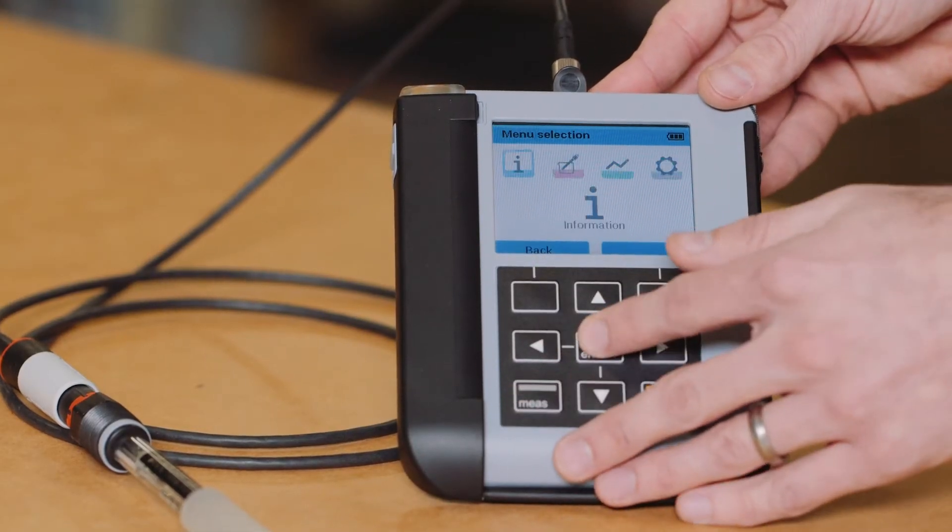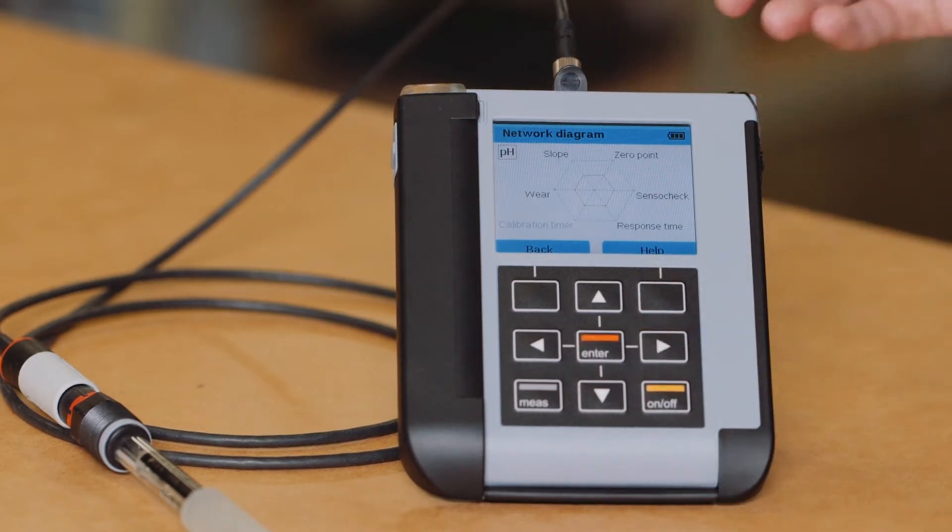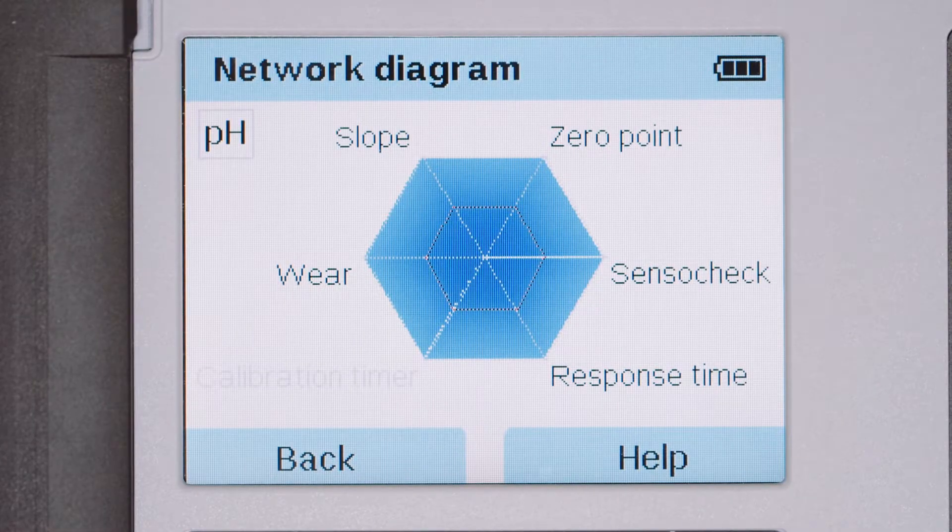For a more in-depth analysis on the condition of the connected sensor, the sensor network diagram should be used when troubleshooting pH and oxygen sensors. The sensor network diagram provides single glance information on sensor parameters which are continuously being monitored. The parameter values in the diagram should lie between the outer 100% and inner 50% hexagon.